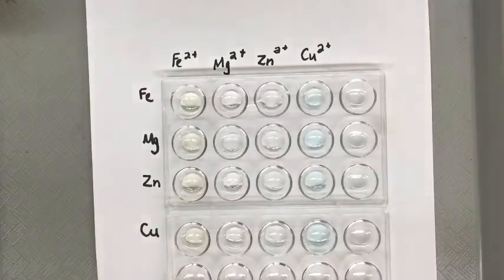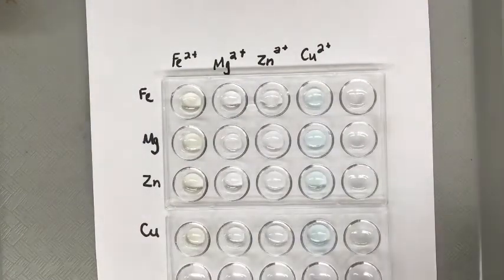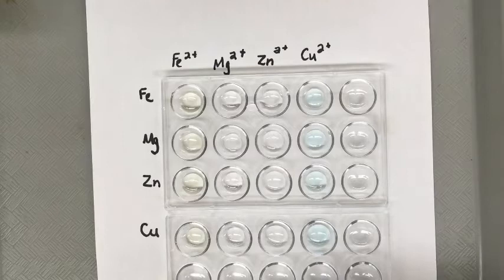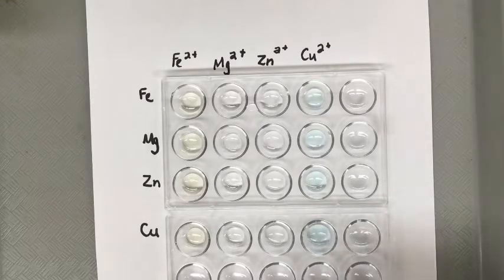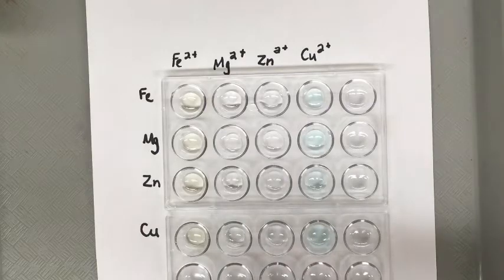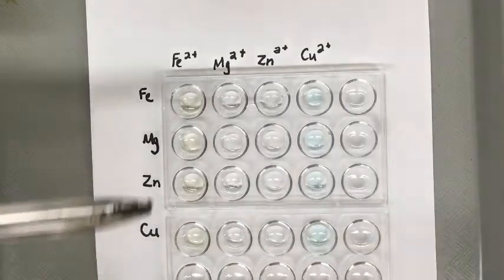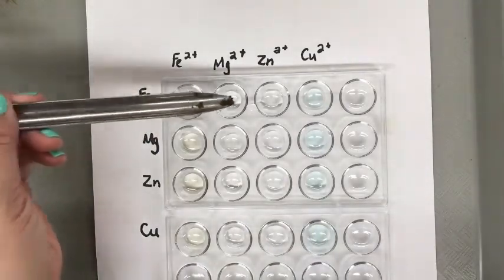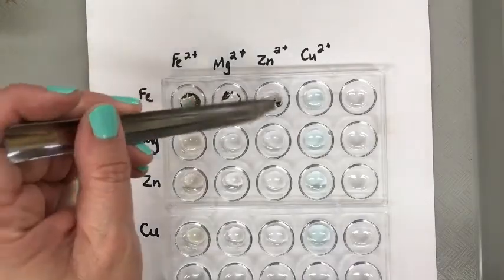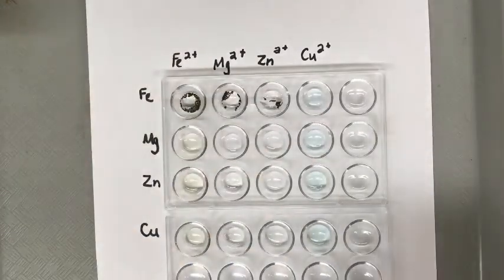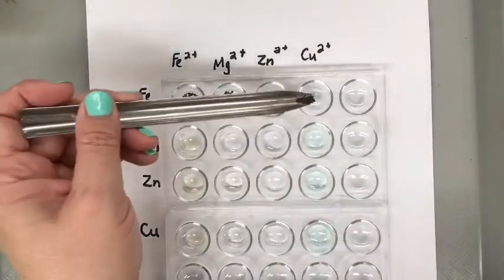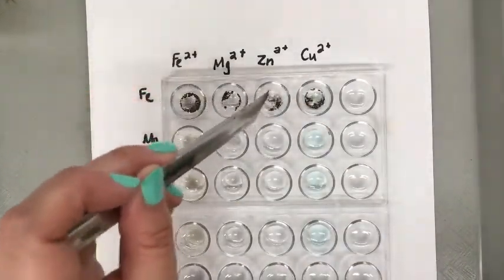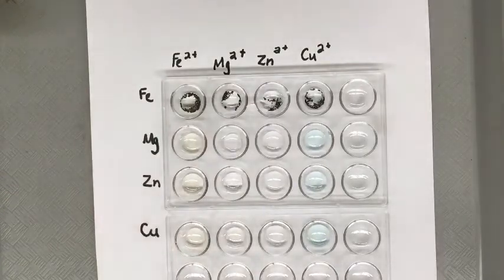Now I'll add some iron to each of the top row. We'll just add a few grains each. Last one, there we go. So we'll let that sit.